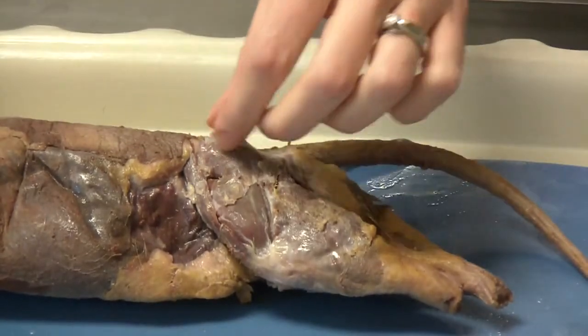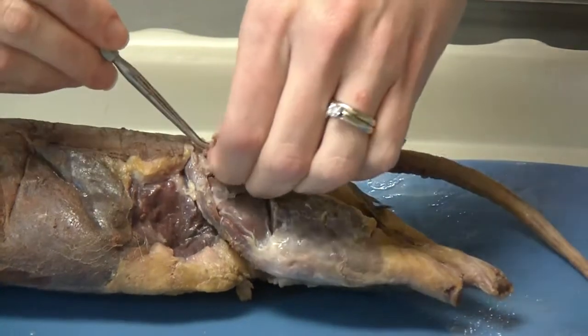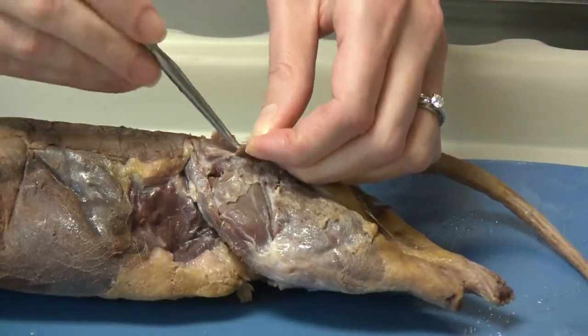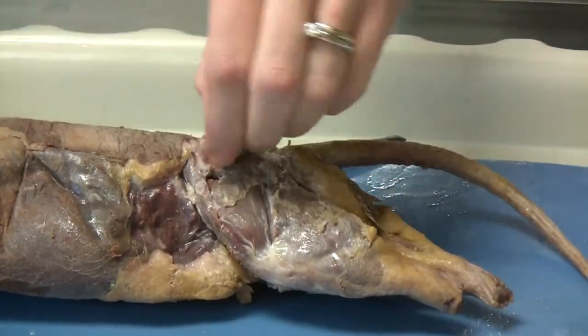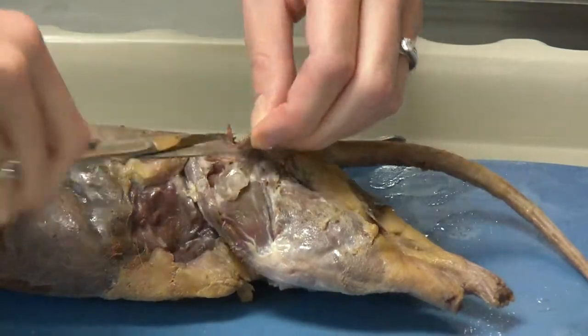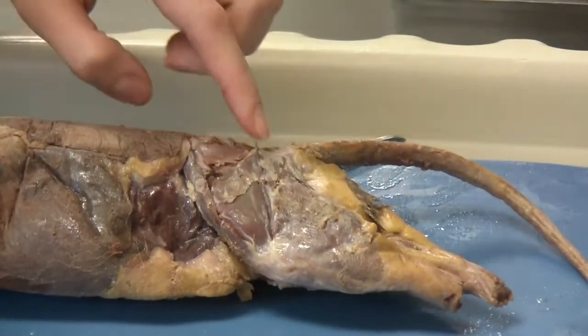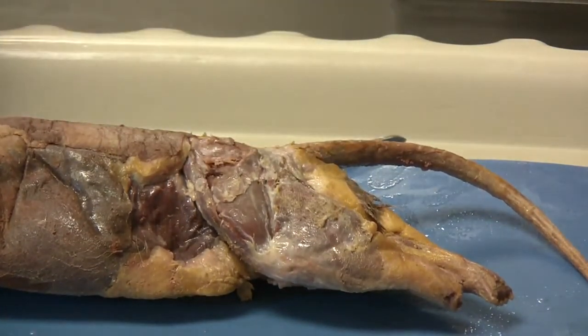If you find that you have cut too far, use your blunt dissecting probe again to separate out and maintain the gluteus medius underneath. You should be able to see a smooth, oval-shaped gluteus medius underneath.